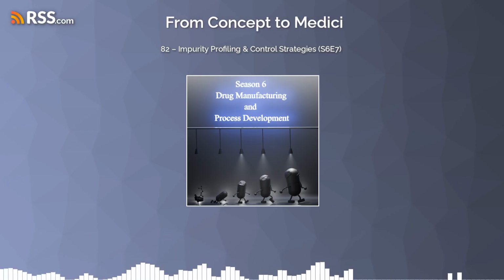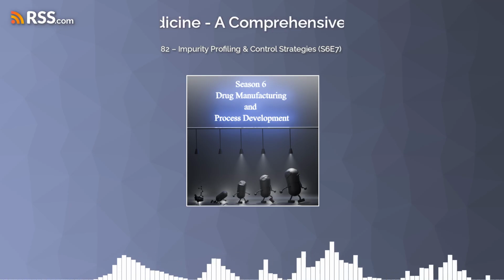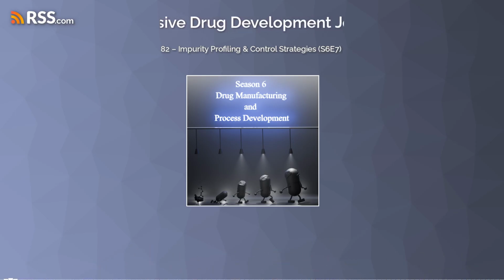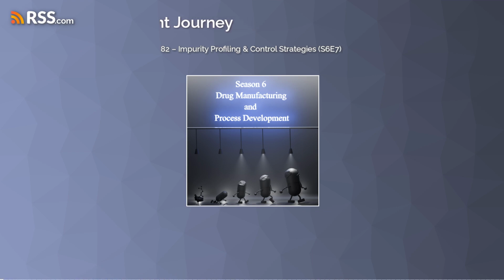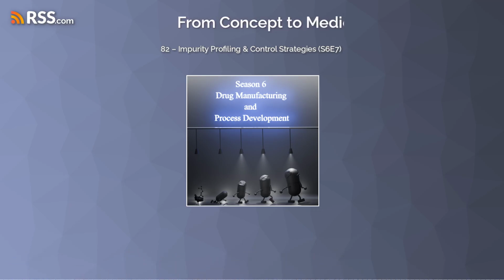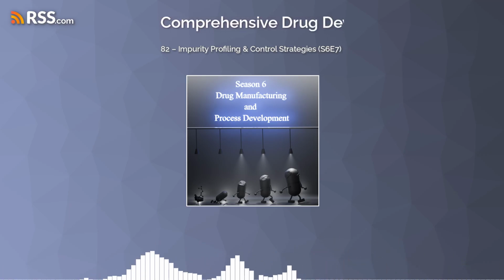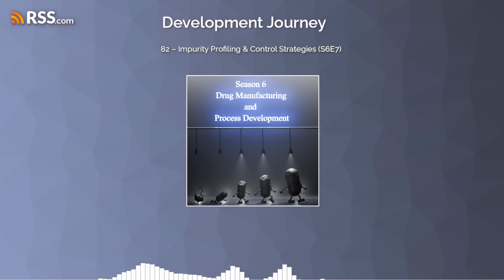One of the sources you sent talked about LC-HRMS, which is just liquid chromatography hooked up to high-resolution MS. That's a mouthful. I know, right? But it's incredible tech. And they used it to identify and measure NDMA in ranitidine. NDMA, this nitrosamine impurity, caused a whole bunch of recalls and investigations. That was huge news a while back. It was. And it just goes to show you how powerful and important this kind of impurity profiling can be. It's not just science for the sake of science. It has real-world implications. For sure.